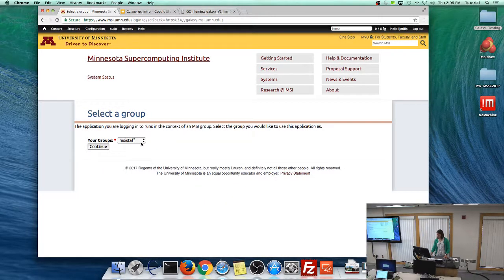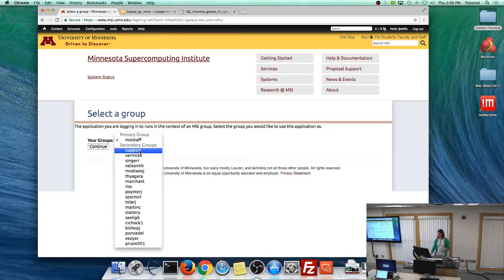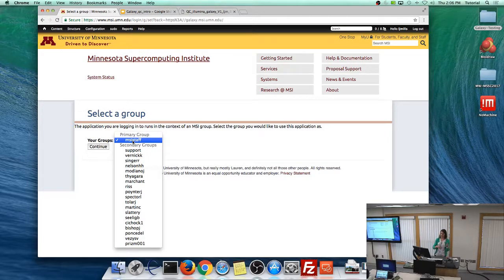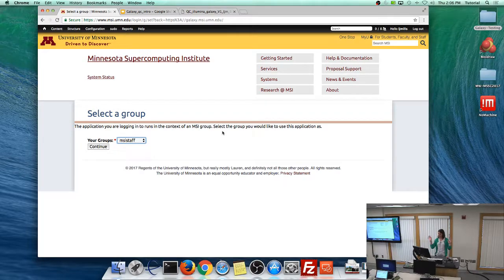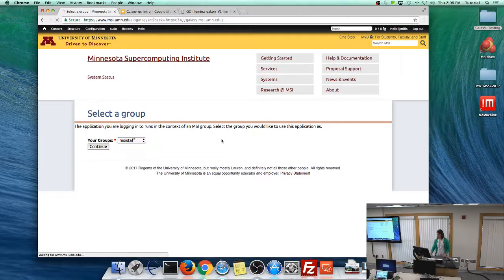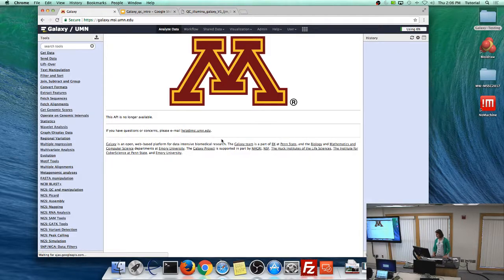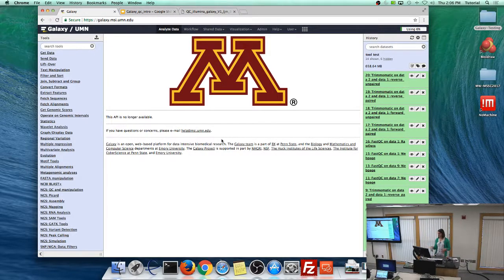If you already have an MSI account, there might be two groups listed — one that says 'tutorial' and one for your normal group. If this is your first time touching MSI systems, you might only be in the tutorial group. Select 'tutorial' if it's an option. Everything will still work; worst case you just have to wait a little while.